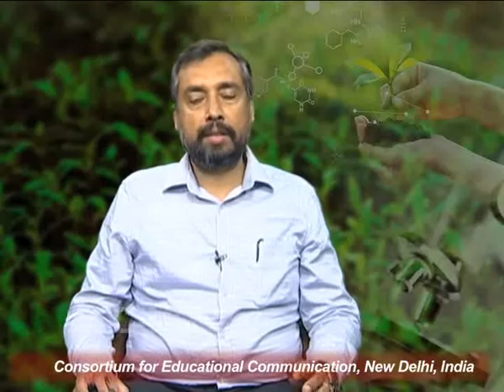So the light microscope which we have discussed till now has 5 different components. In our next lecture we will try to understand the basic concepts of a stereo microscope and how contrast in the phase of the light can also enhance the quality of the image created. We will talk about phase contrast microscopes, and then we shall move on to different types of electron microscopy.